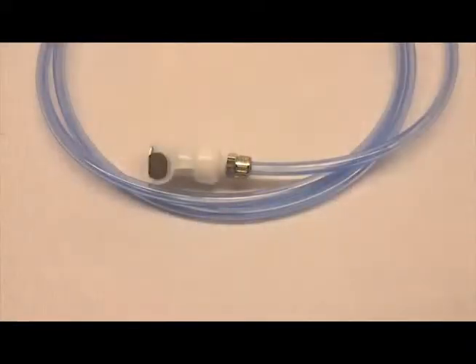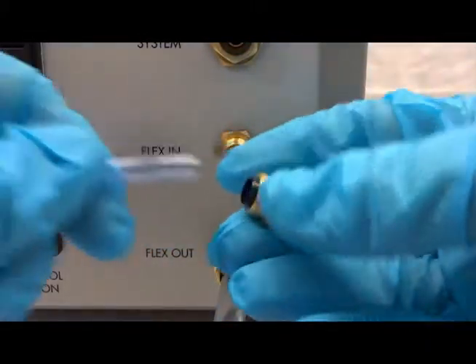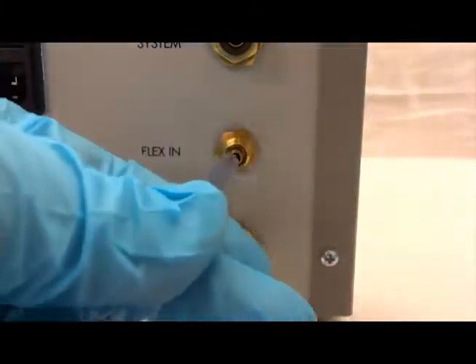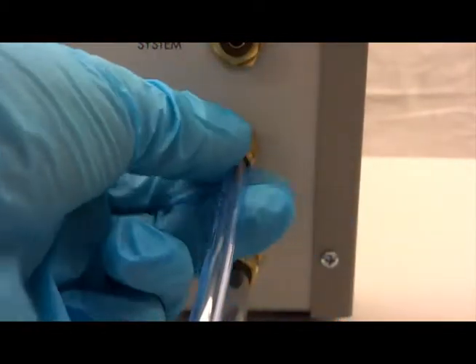Connect one end of the blue 1/4 inch or 6.4 millimeter tubing to the flex in port on the back of the flex link. Remove the brass nut with the acetyl sleeve from the flex in port, insert the tubing into the acetyl sleeve, push the tubing onto the fitting on the back of the flex link box, and thread the nut onto the fitting by hand.